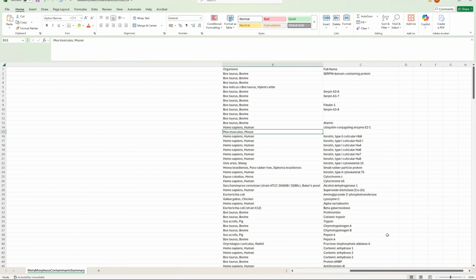It's because our software is so automated that we've allowed people to not have to get as close to the metal and not be as involved in the analysis. That's what we've aimed for. We've wanted to automate this as much as possible. But I appreciate that some people out there will be used to getting this level of detail from their analysis. It's a double-edged sword because having that level of access to all of the settings of the parameters for your analysis is one source of inter-operator variability and inter-operator error. How do you know everyone's using the same settings that you are?